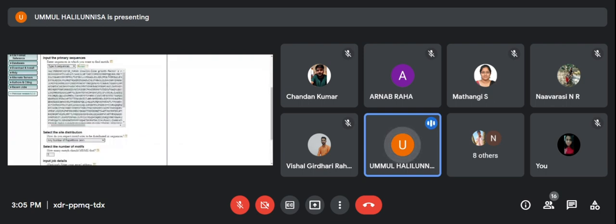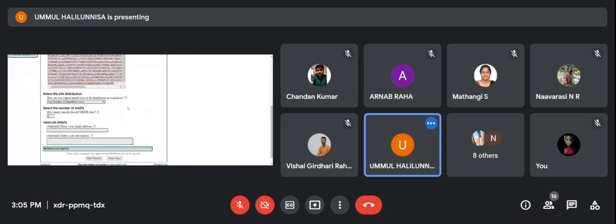This is another protein. Let's check for this one. Any number of repetitions should be okay.